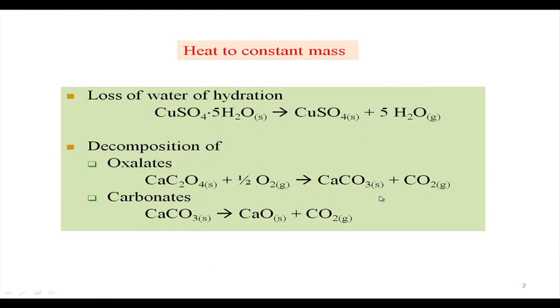And now what we want to see is that the plots we have seen are basically 2 important studies we can make by thermogravimetric analysis: the decomposition and degradation of calcium oxalate to calcium carbonate, and this calcium carbonate to calcium oxide. So, here we see that we start from the hydrated salt. Calcium oxalate is also a hydrated one, which we have just seen is a monohydrate. That monohydrate will give rise to the corresponding anhydrous form of calcium oxalate.